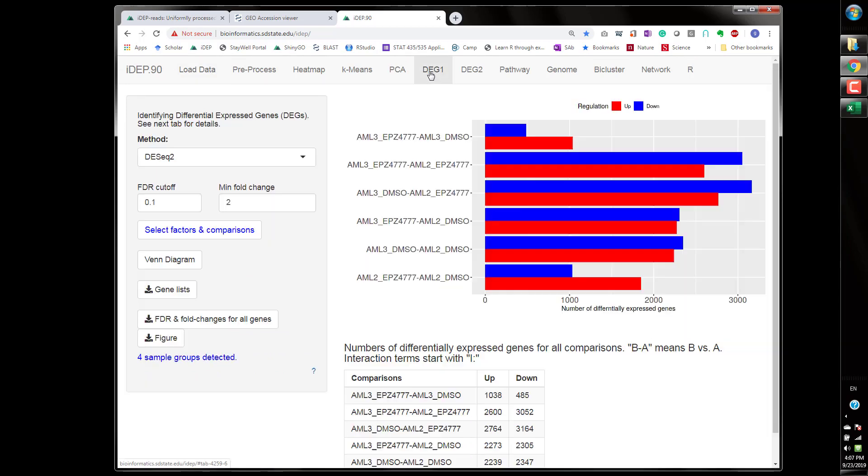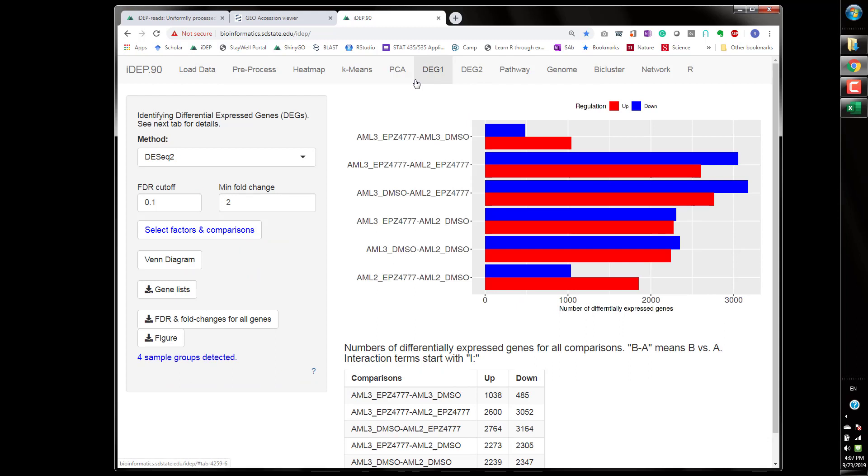There you can take a look at these numbers you can see these are read counts some are very high very big numbers and the next thing we want to do obviously is to run the identify differential gene expression and this will help us understand the data a little bit.